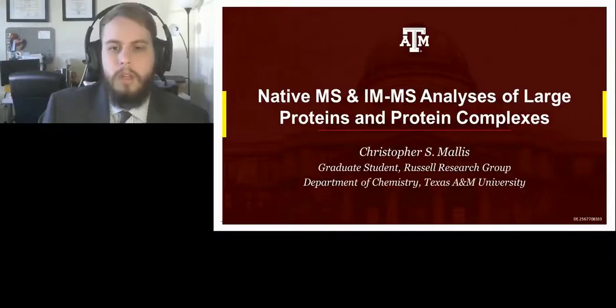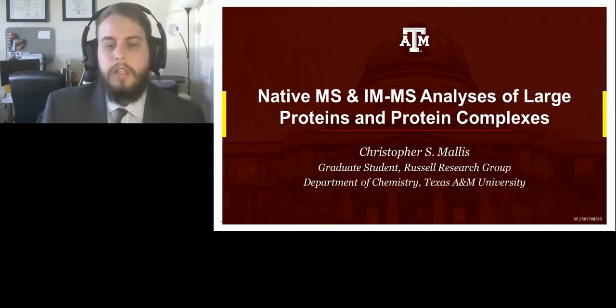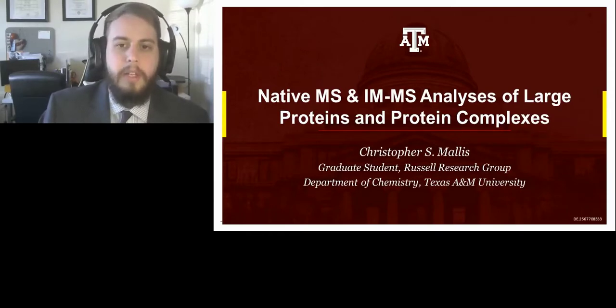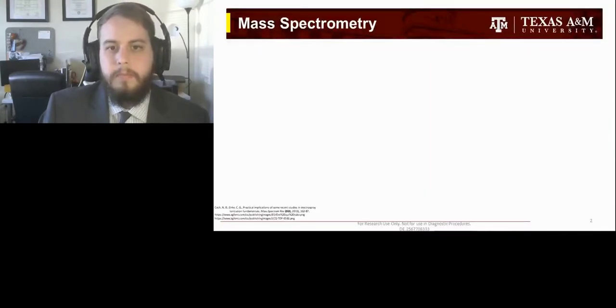All right. Hello, everyone. My name is Christopher Mallis. I'm a graduate student in the David Russell Research Group at Texas A&M University. And today I'm going to talk a bit about some of the work that we've done with native mass spectrometry and native ion mobility mass spectrometry of large proteins and protein complexes. Really trying to study these proteins in their native folded as well as intact states for the protein complexes.